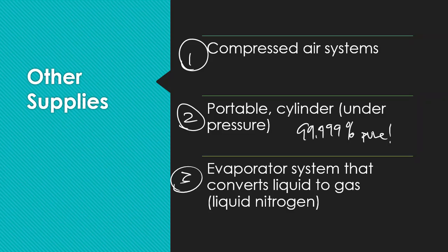Number three, we also have evaporator systems. And evaporator systems convert something that's maybe liquid into a gas form. So it evaporates. I want you to think of maybe boiling water on your stovetop.